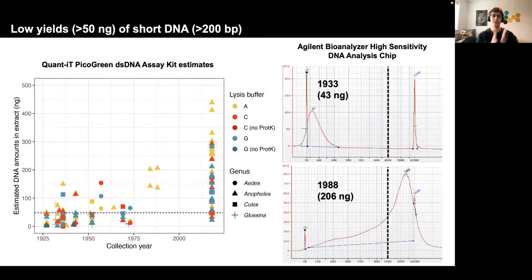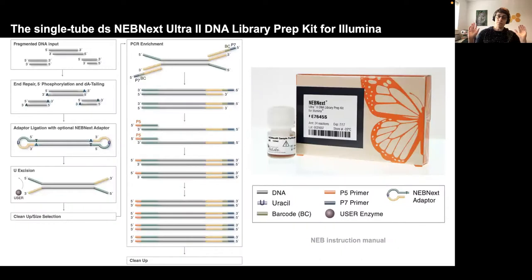And when we saw this, what we saw is, well, this looks like a very bad present-day sample, but that also means that we could technically just use the same approach we do for the present-day samples and modify it a little bit, which our hope was if we keep the library prep as similar as possible, we will also minimize biases downstream once we actually get to population genetic studies. So our thought was, yes, let's just use the same kit that is used for the present-day samples.